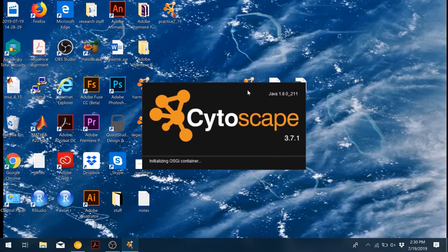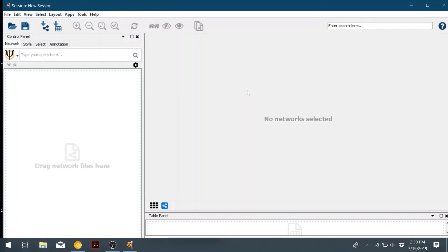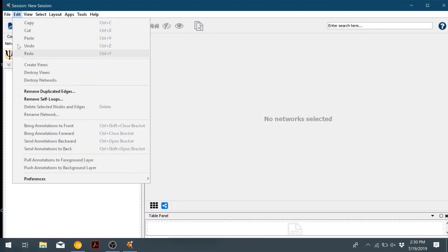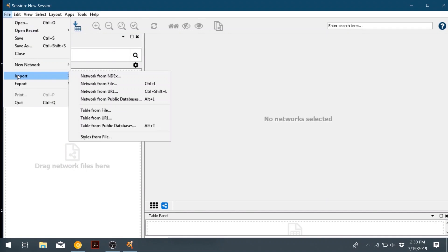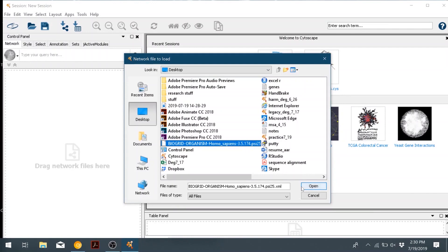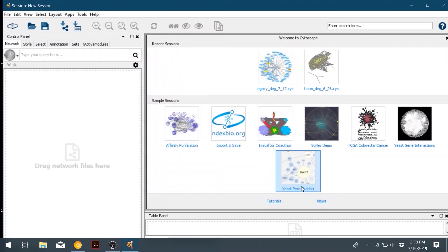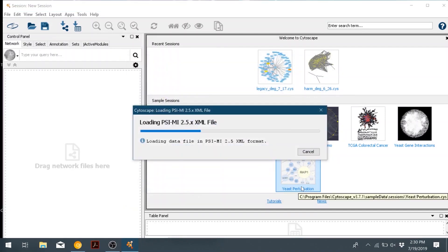So go ahead and open Cytoscape. Now we will create our network by going to file, import, network from file, and then choose the BioGrid organism file that you had saved before. And then the next step will take a long time just to load the network.